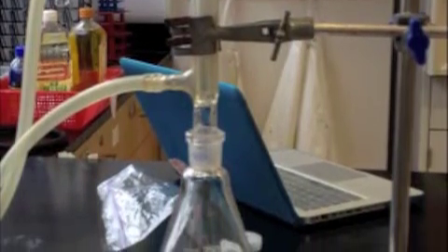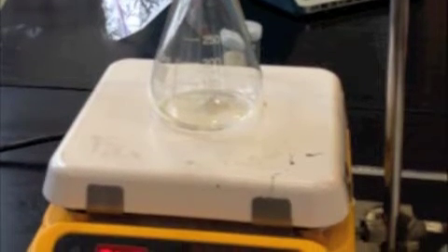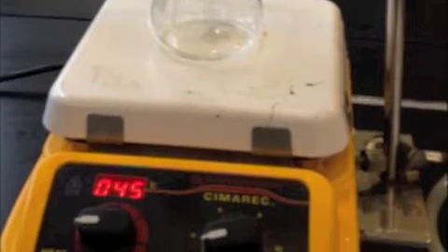Placing the flask in ice water cools it down, enabling us to handle the flask more easily. Having the smell tester stand 10 meters away provides a barrier of distance which the ester scent could not cross, and thus enabled the smell tester to accurately determine at what distance they smelled the ester.